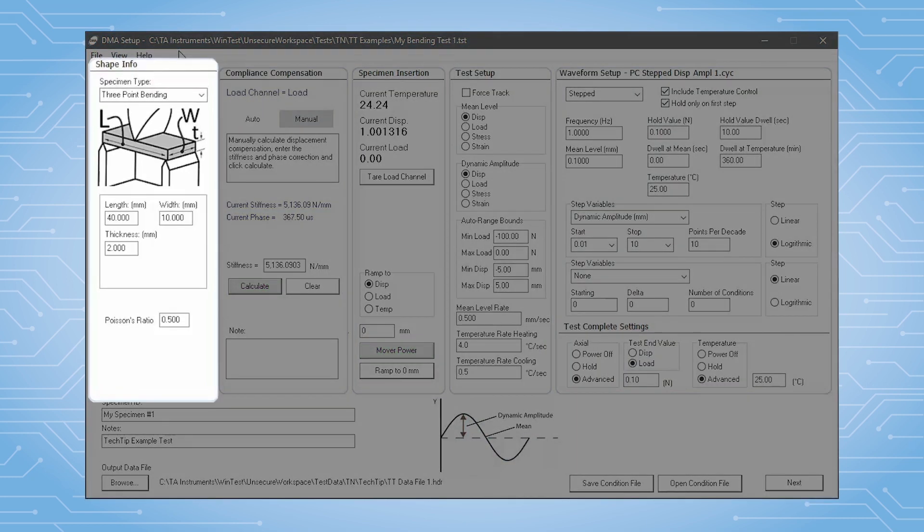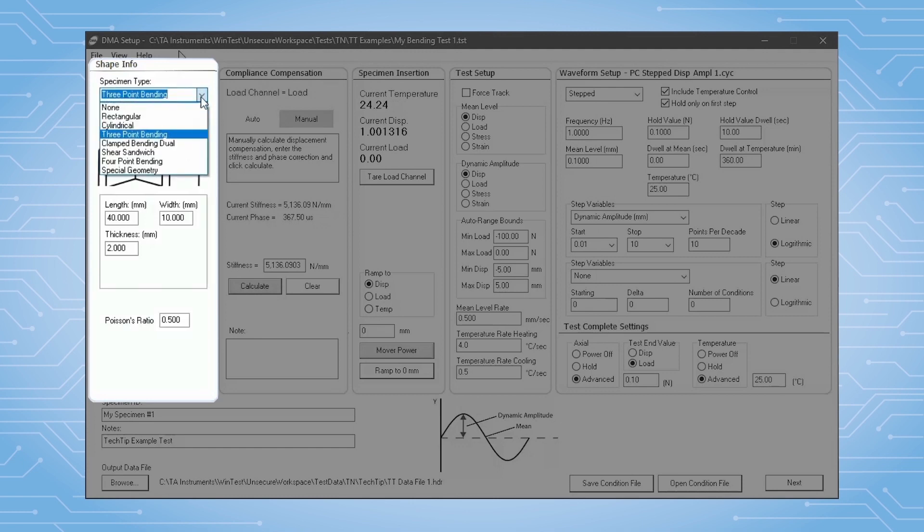The specimen shape section allows you to define the specimen geometry and dimensions and offers many choices for typical DMA geometries or shapes.